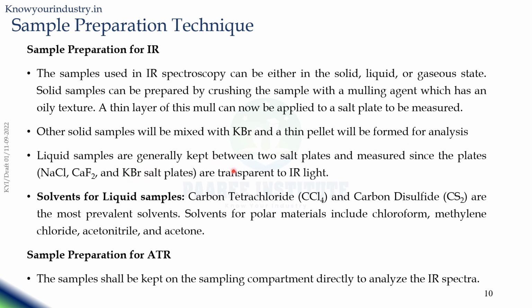Liquid samples are generally kept between two salt plates and measured since the plates are transparent to IR light. The plates are made of sodium chloride, calcium fluoride or potassium bromide. Solvents for liquid samples like carbon tetrachloride and carbon disulfide can be used for the infrared spectroscopy measurements.